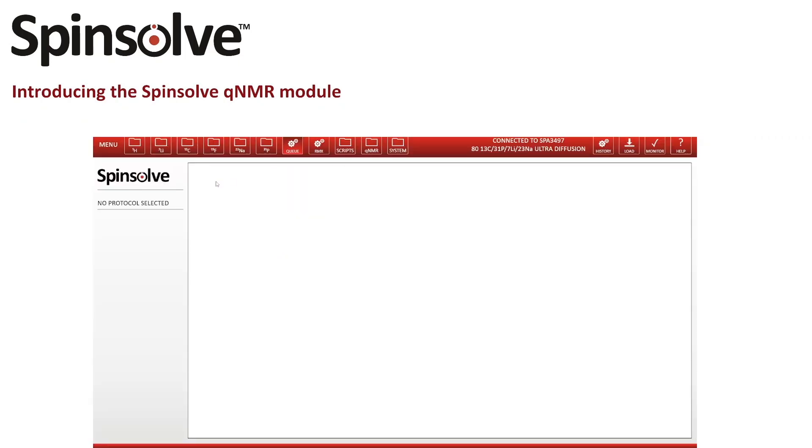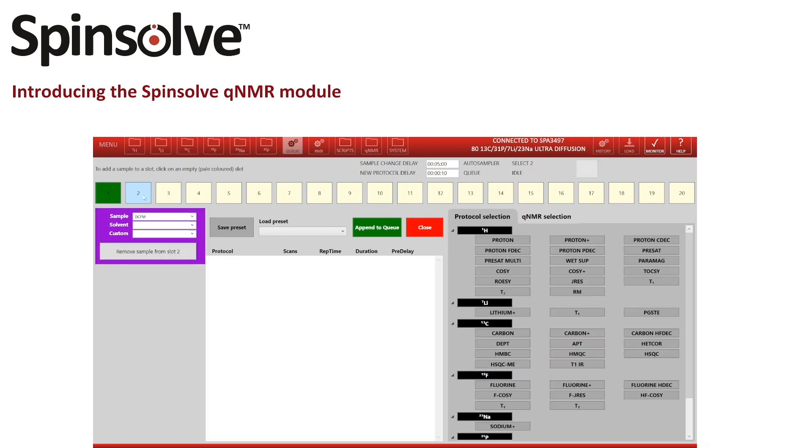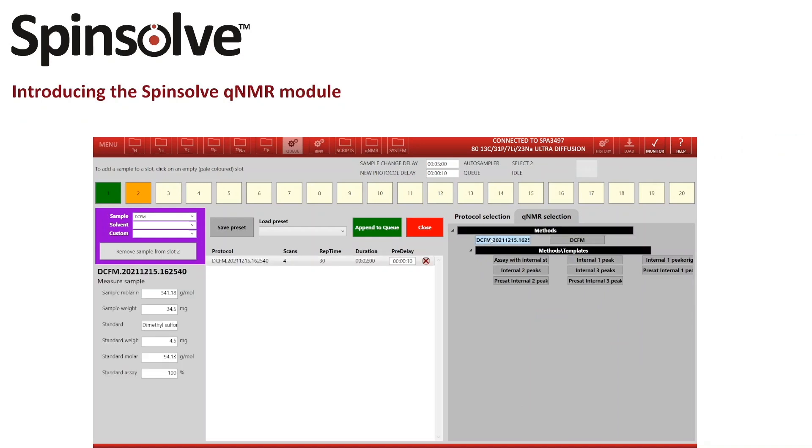The QNMR module is of course also completely usable in combination with the Spinsolve Auto sampler. Once a method is set up, one can choose it in the queue menu, enter or change the sample specific information, and append the measurement to the queue.